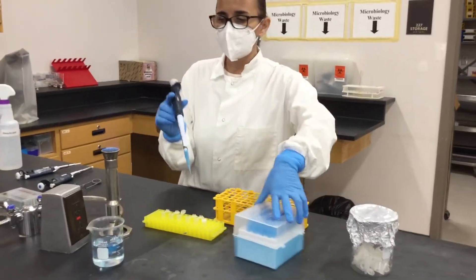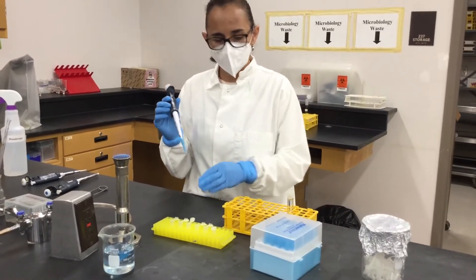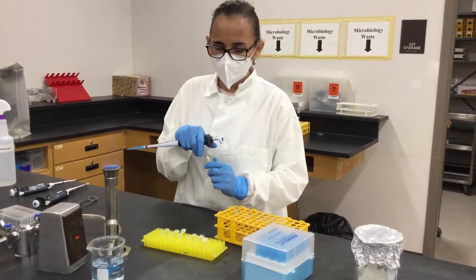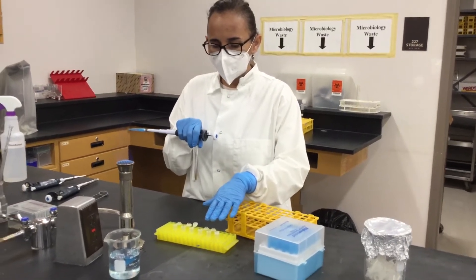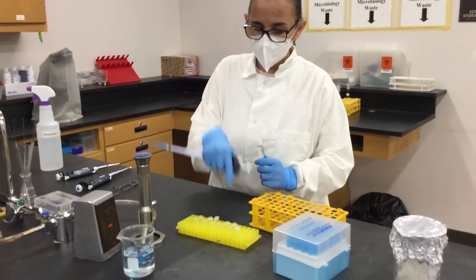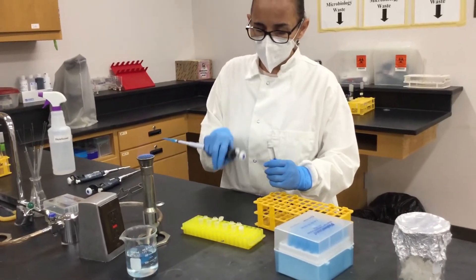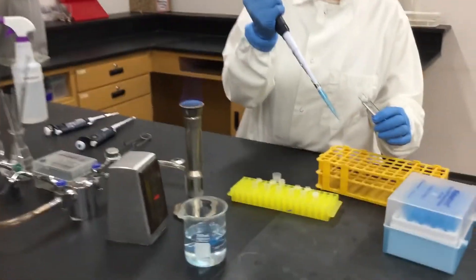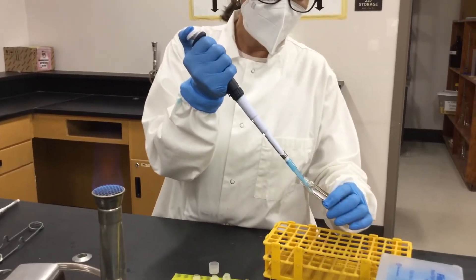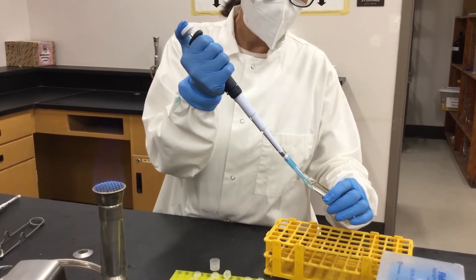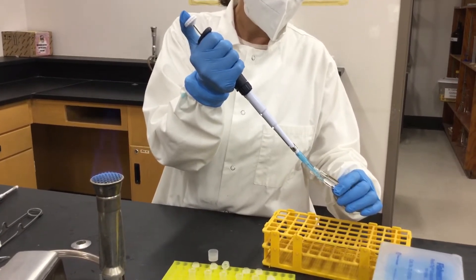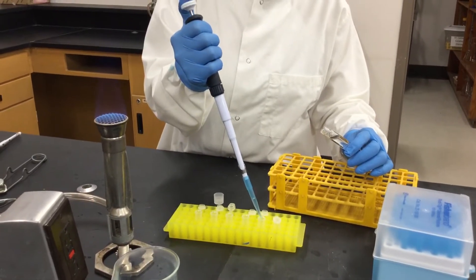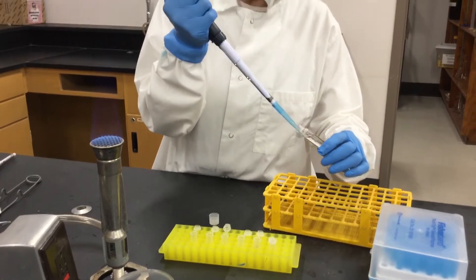We will be using 990 microliters of sterilized water in the first tube. These are microcentrifuge tubes, so we have five. To the first two I'm going to add 990 microliters of water. You press the plunger until the first stop, grab your water carefully by releasing the plunger little by little, and then add it into your first two tubes.